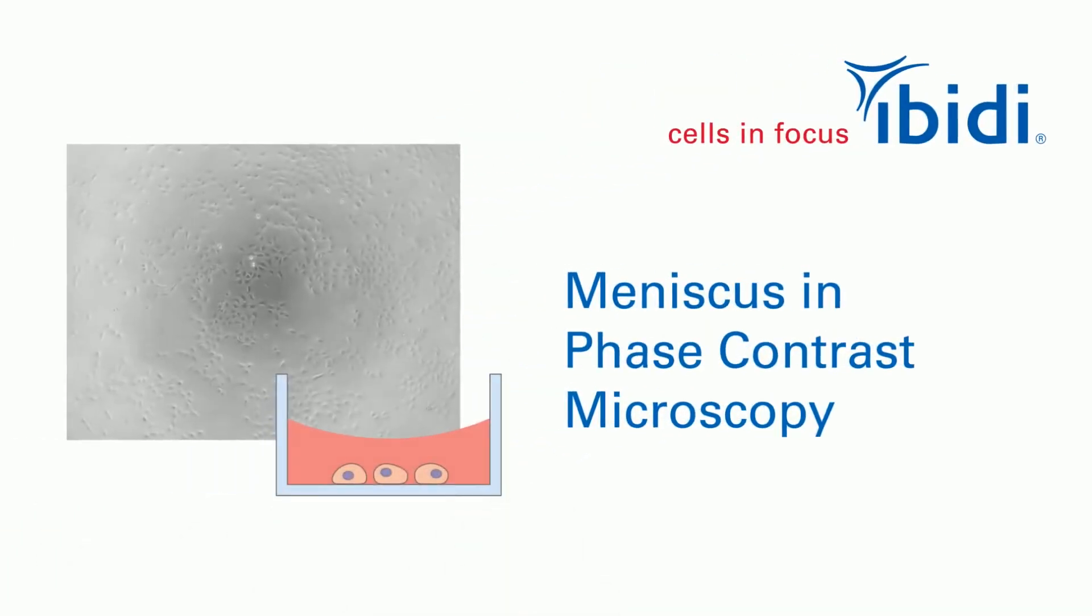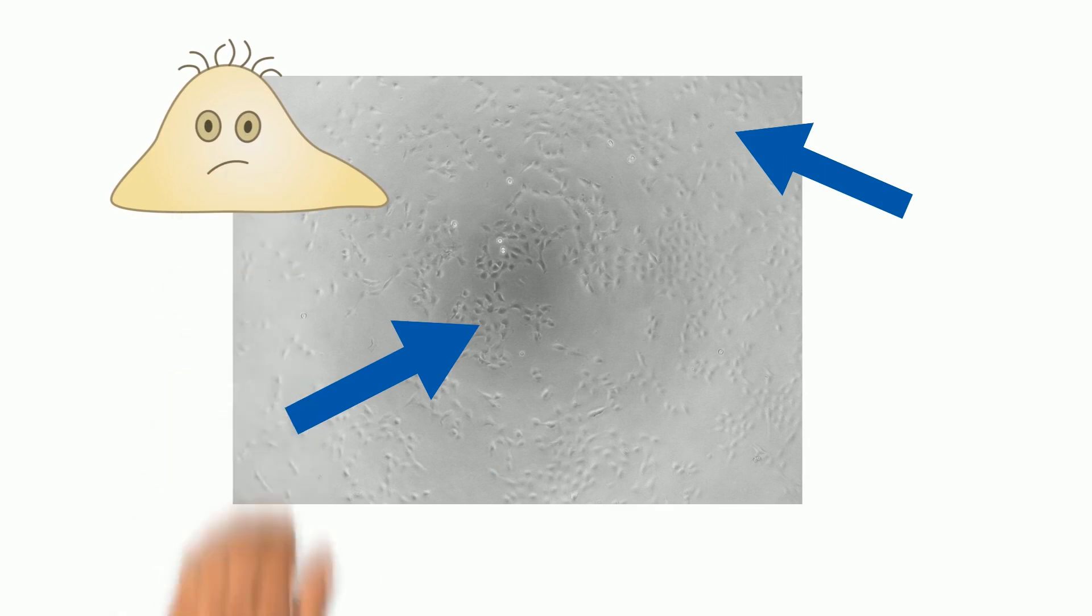Meniscus in phase contrast microscopy simply explained. Do your phase contrast images always look like this? Do they have a sharp center but blurry edges with low contrast? This can be frustrating, but there is a simple explanation for this.